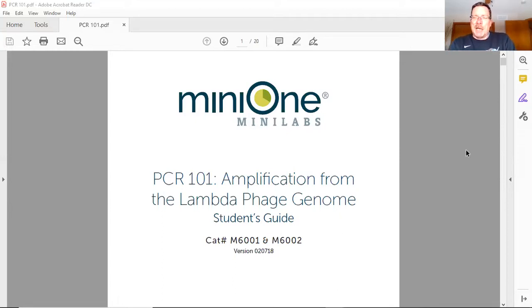Your job today isn't the lab. I'm working on that myself. I'm getting that all done and filmed myself. But your job today is preparation. So what you need to do is, I decided on MiniOne, this is the company that I got the equipment from off the grant. And so rather than breaking this into pieces, since you're not in the lab with me, I just uploaded the whole student guide lab manual, and that's what I want you to go through for the most part today.